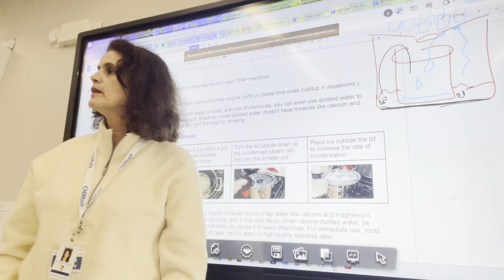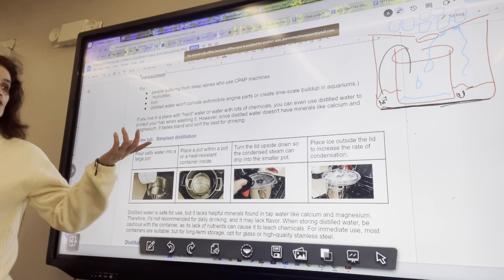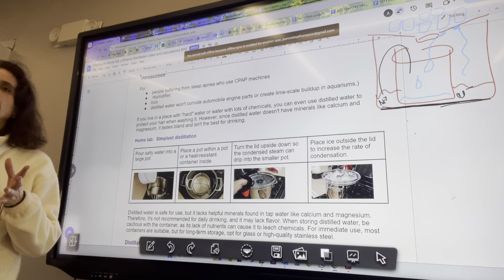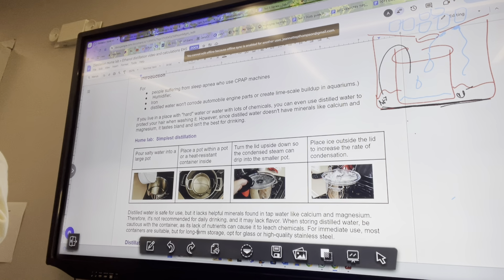So when it's snowing outside, you'll be making salt solutions inside. Wonderful. Lovely. This takes a while. You don't have to do the whole thing. I just want you to at least put the stuff together, get a little bit and stop. You know, that way you will never forget what distillation is. If you don't do it, you will forget.